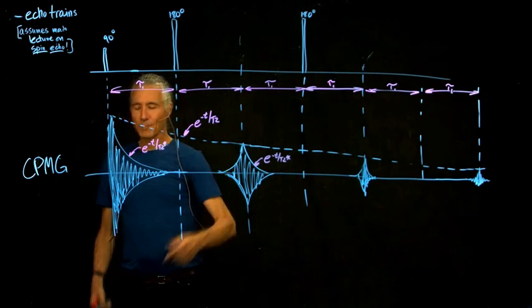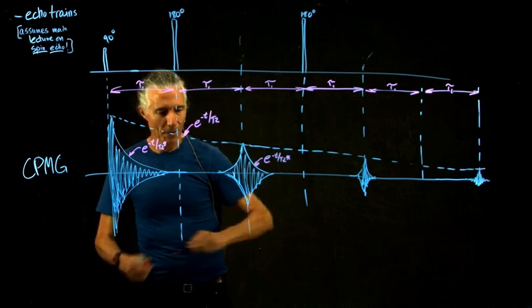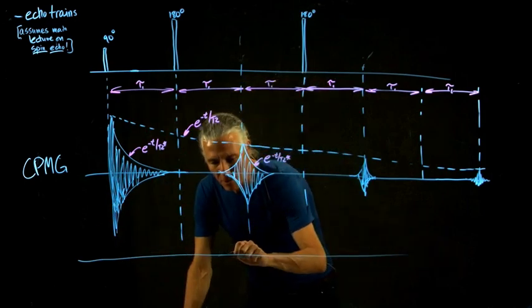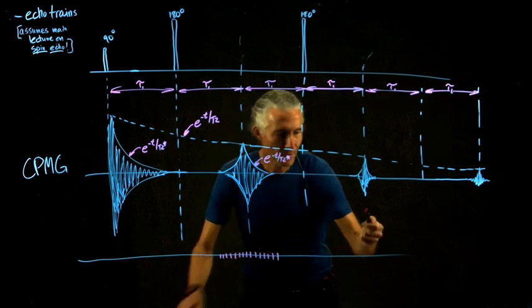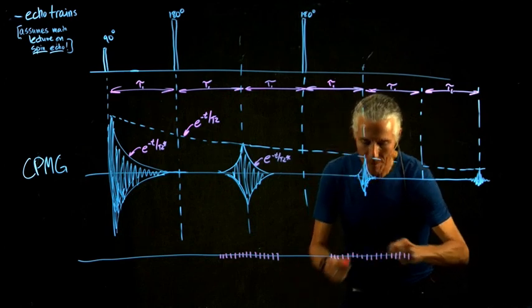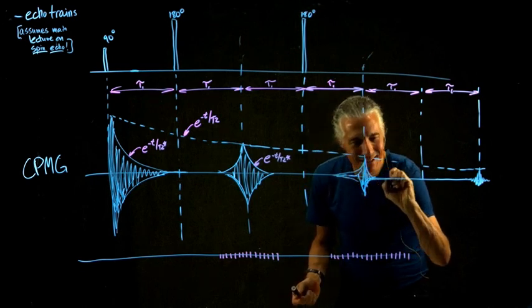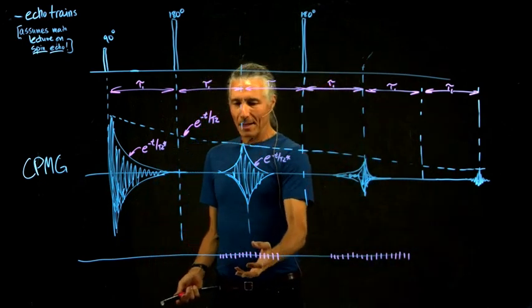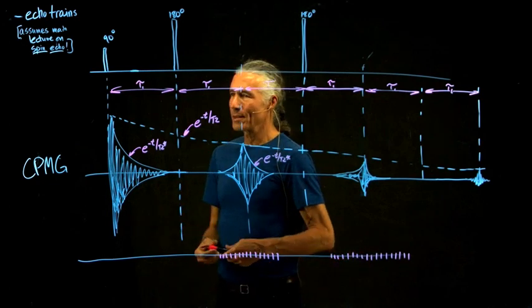And so this is a way of continuing to collect data. So this is the whole signal. Typically what you're doing, however, is you throw away the FID, you don't record that, and then you just record some data points. We just record some data points here when the echo comes. And when we get to this echo, we just record another burst of data points in this echo, because this echo isn't totally dead yet. There's still some signal there. So basically what you can do is get 4 times or 16 times as much data out of one 90-degree RF pulse.